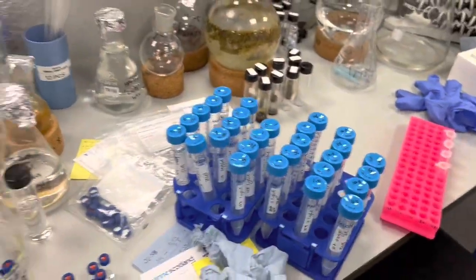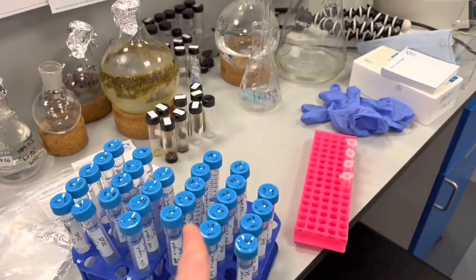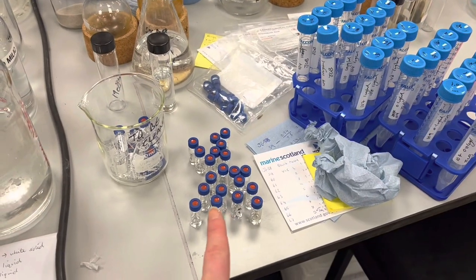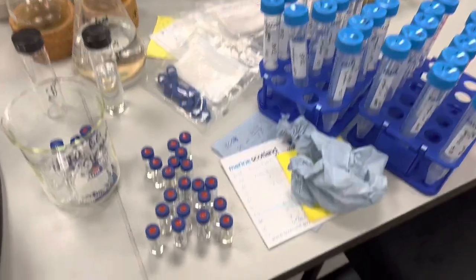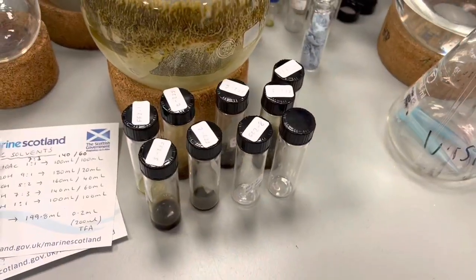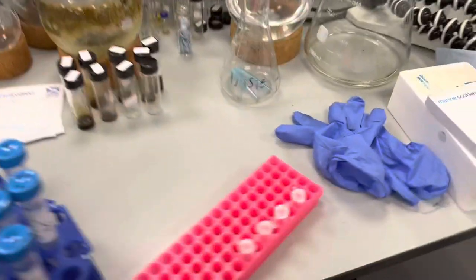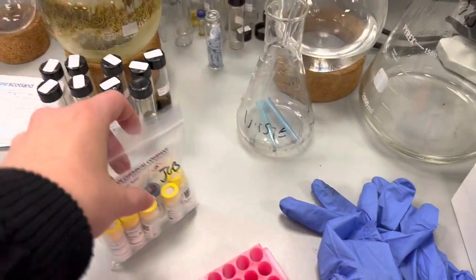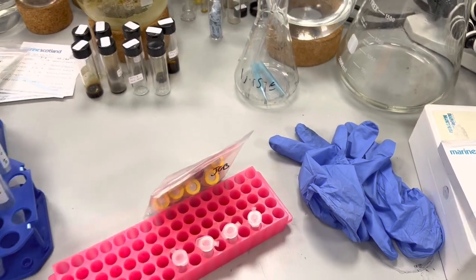Oh, please excuse this. Look how much of a mess my bench is in. I need all of this stuff today. These are vials which I have just not wanted to clean for a very, very long time, but I need to clean them and transfer the samples back to their vials. These need to go into the cold room, and let's just ignore all the other stuff. It's an accurate depiction of what my brain is looking like right now. Right, those vials need to defrost and then I can get started with the bioassay.